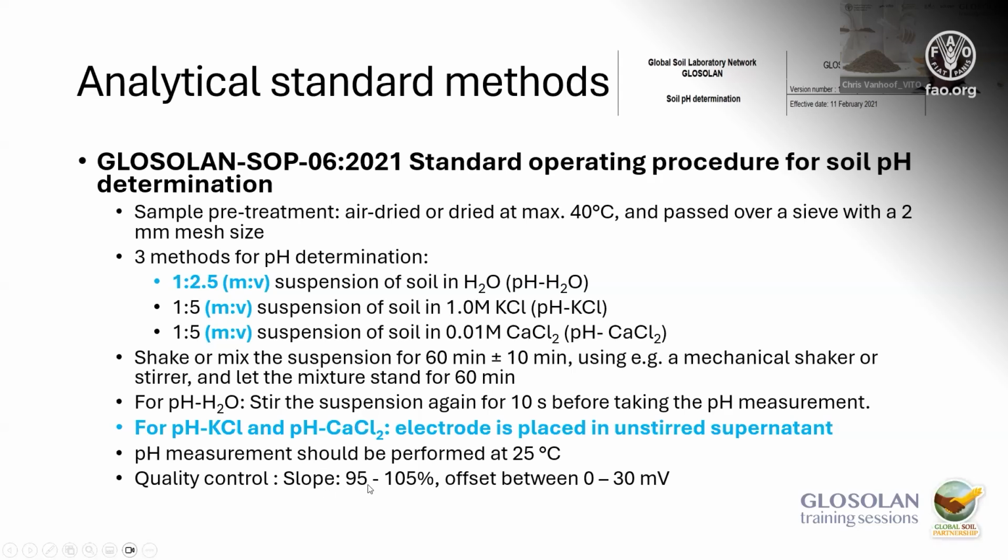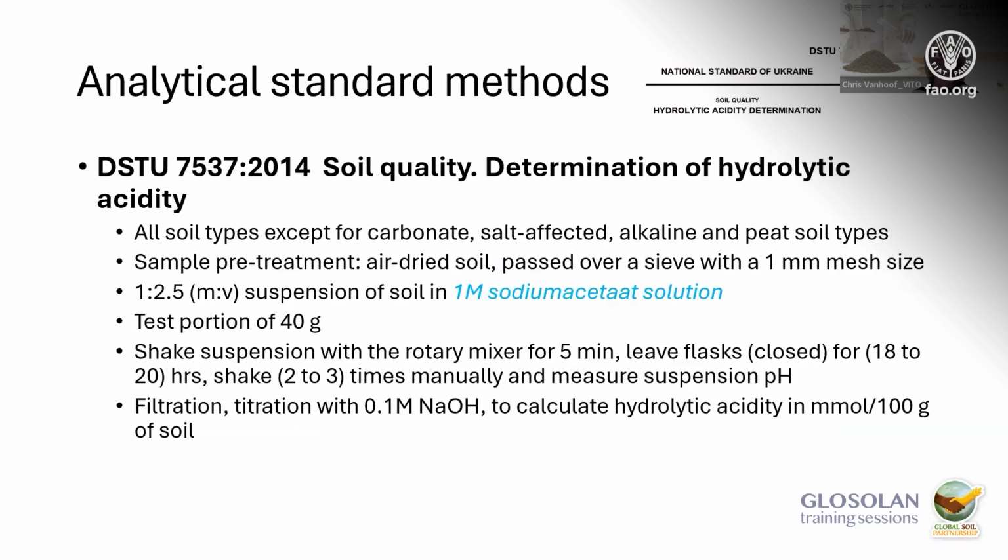I will come back to that later on, but here the slope of the calibration has to be between 95 and 105%, and the offset has to be between 0 and 30 millivolt. But I will come back later to these quality control aspects.